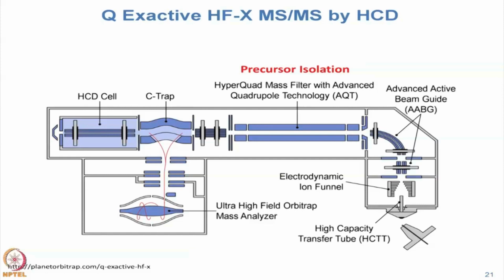So this I think of as today the workhorse type of instrument that, if one was setting up a lab to do proteogenomics in the way that we are going to describe having done it in the CPTAC program, this instrument would be the one that one would get today.